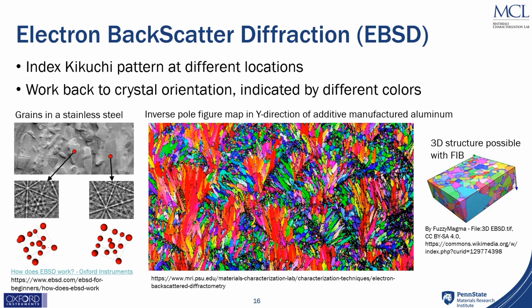Also, if you have a focused ion beam, it is possible to etch away sections of the surface and do this as a depth profile, and then you can actually get the full 3D structure of the grains inside of a sample, which is pretty neat.